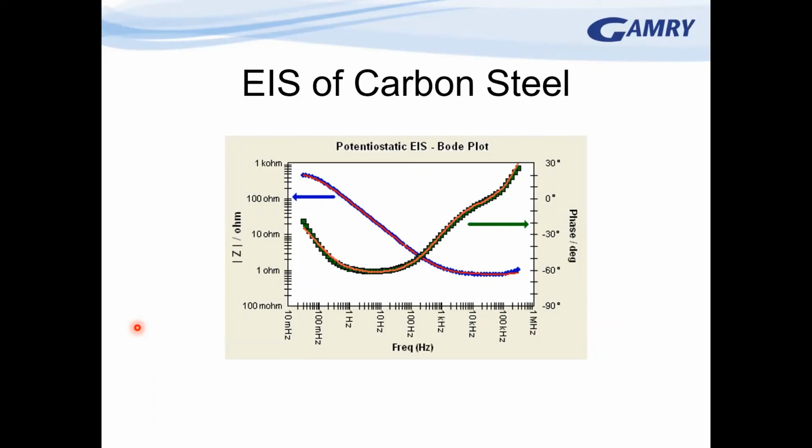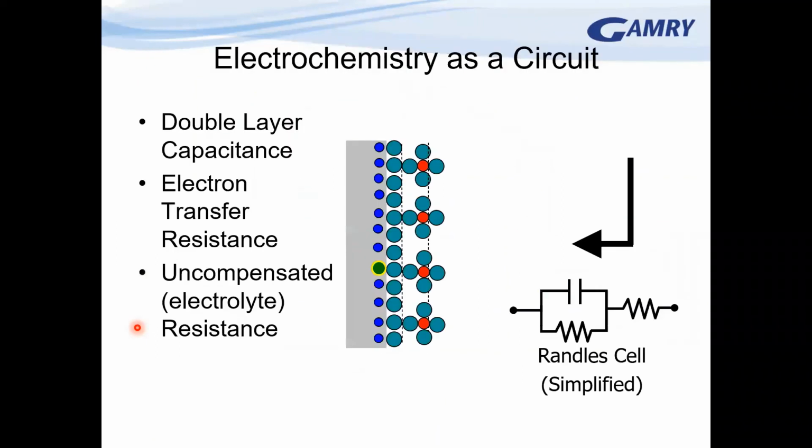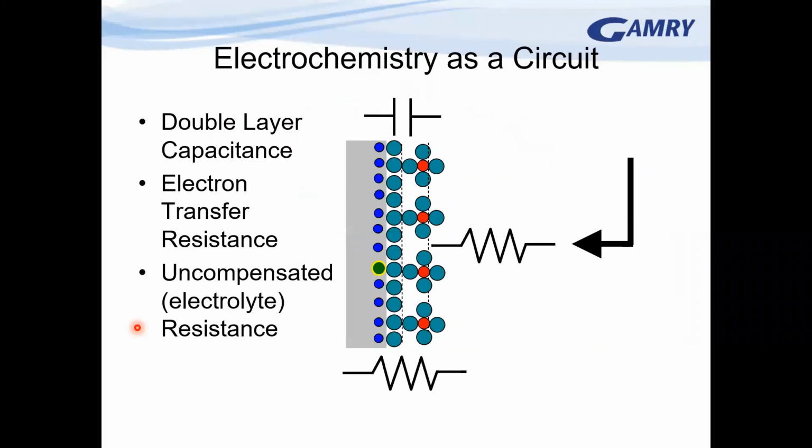So in the case of this kind of surface, if we're saying that there's one reaction going on the surface, and we have capacitance due to the double layer all over the surface, then that's the model that we have to pick.